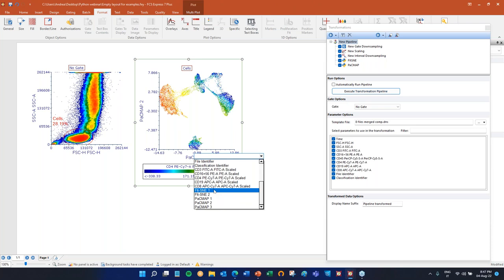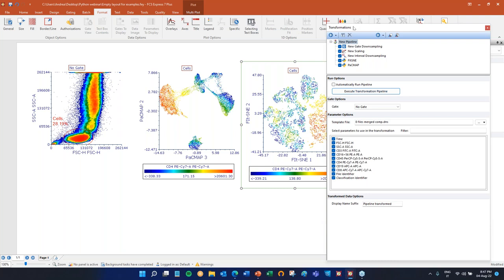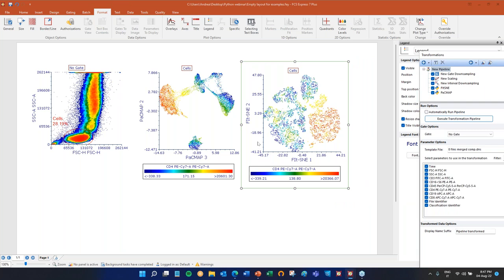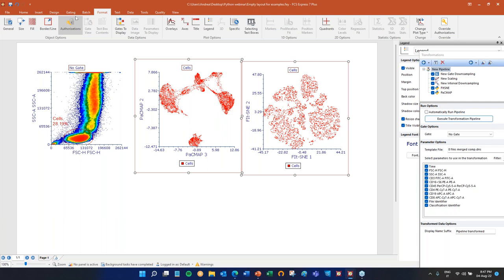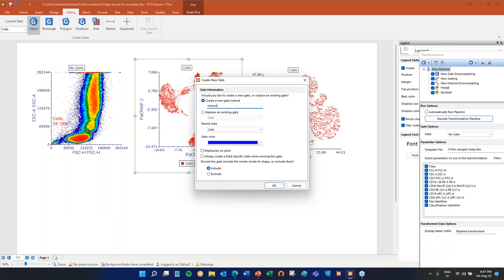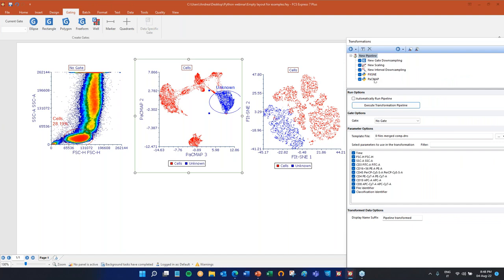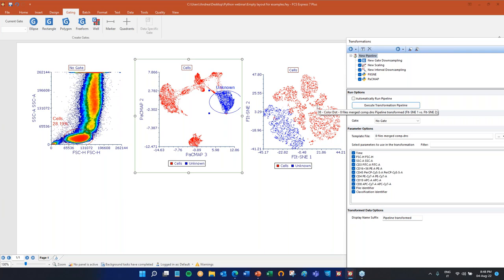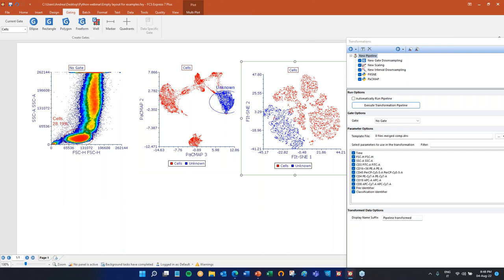It's done. We have PacMap1, 2, and 3, and also FITsne1 and FITsne2. Let's display these — a density plot with color based on expression of CD4. You can also use a color plot, and then you can use back-gating. I can create a gate on this island and call it 'unknown,' and you can back gate. I added two Python transformations but you can add as many as you want — and also add as many UMAP, FlowSOM, or tSNE as you want. Once the pipeline is run, you'll have live-updating plots with back-gating and density-based coloring.